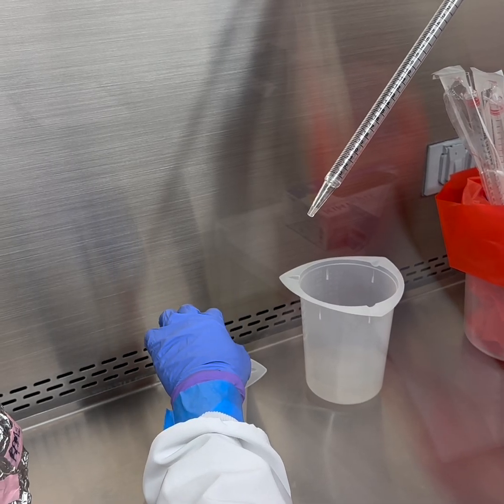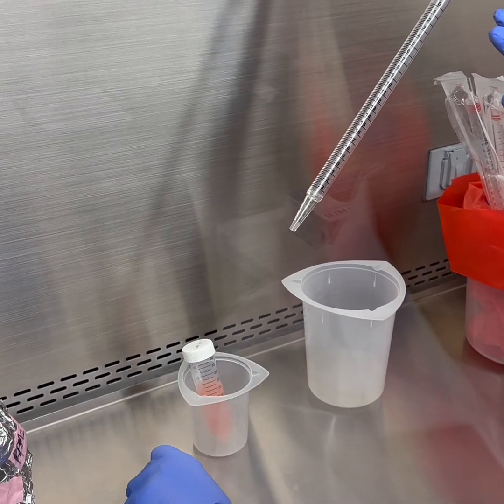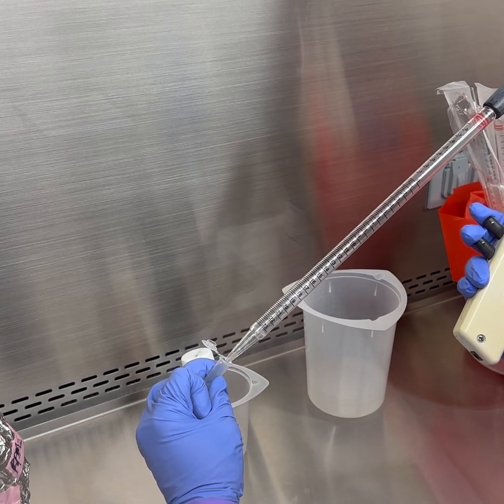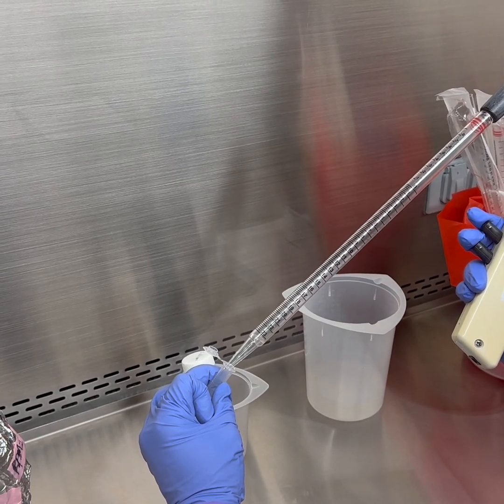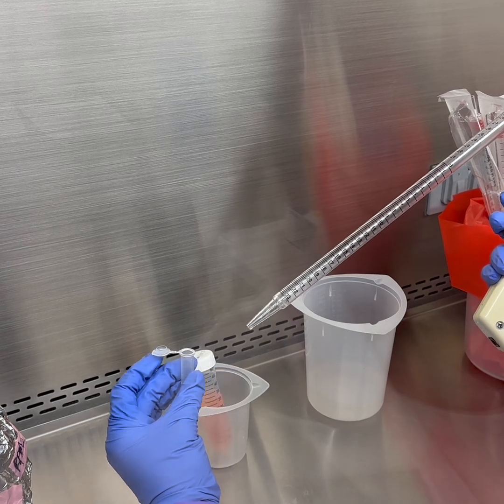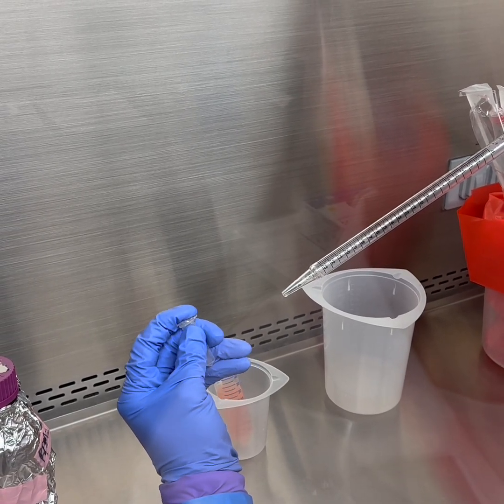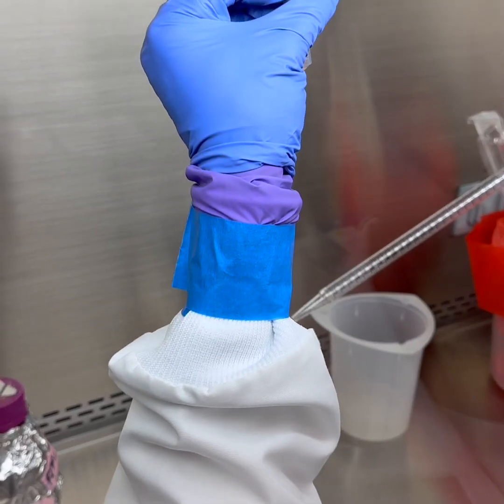You can perform the hemocytometer dilutions in the hood, or you can do it on the bench top. I'm just going to do it on the bench top because it's going to be outside the hood anyways, so might as well. But see, we have a little bit.